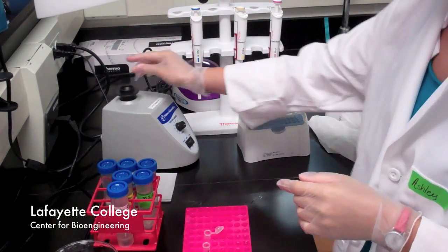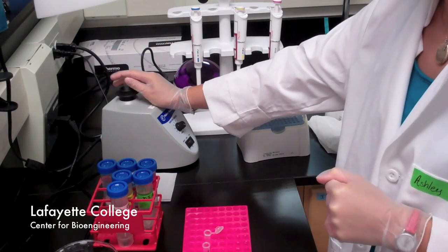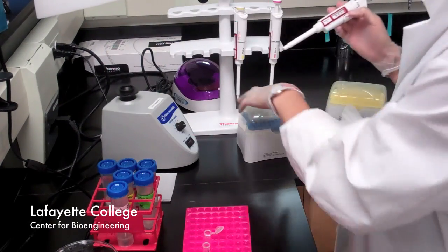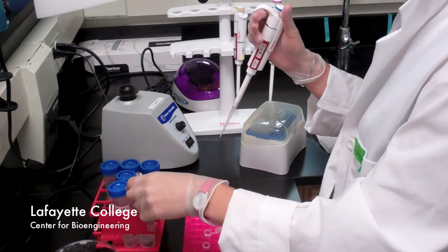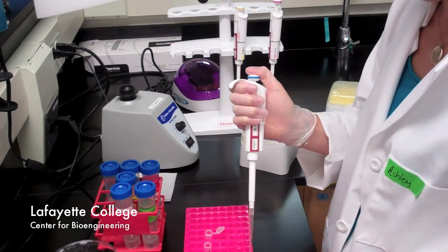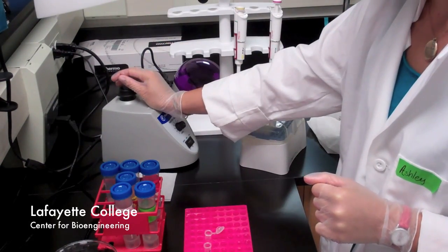First, vortex the cells on high speed for approximately 1 minute. Verify the volume of RLT that the cells were harvested in. Add an equal volume of ethanol to the cell and RLT suspension. This volume will be either 350 or 600 microliters. To ensure complete mixing, vortex the solution at speed 1 or mix by pipetting.